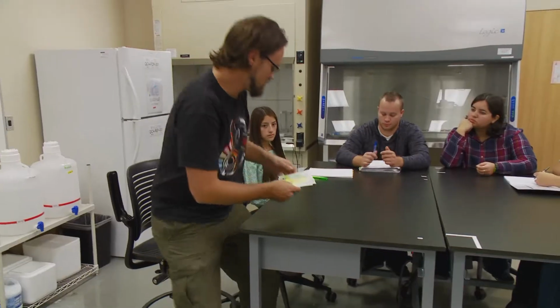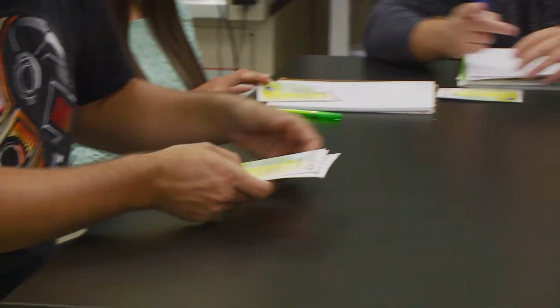Really, the first step is research and development. Make sure that we have a plan that, at least on paper, looks like it's going to work. So the product that we have is based on the unknown plasmid lab for our high schools, where you have the 3 plasmids, but we don't know what ones they are. So this goes over the kit.